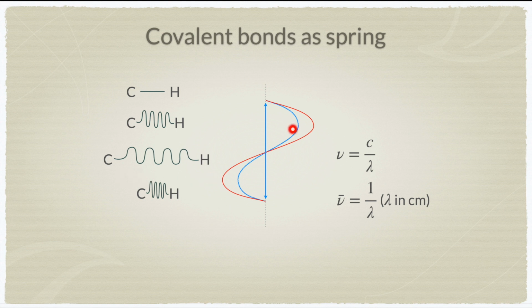Instead of cancelling, absorption takes place, and when absorption takes place, the intensity is slightly more. You can see this wave still has the same wavelength, just of higher intensity. That means the molecule now absorbs the radiation, and it is intensified. This is a simple way to understand how a molecule interacts with IR radiation.